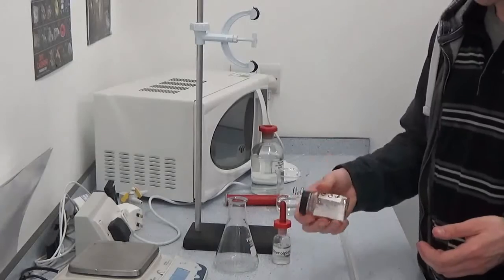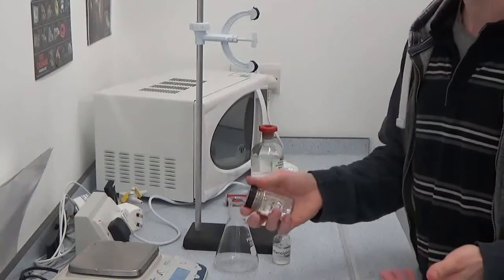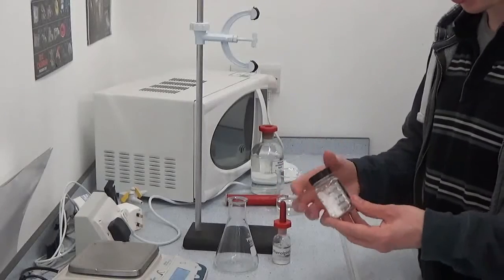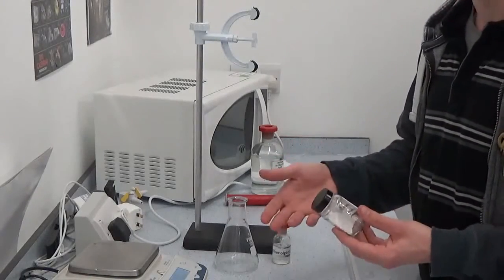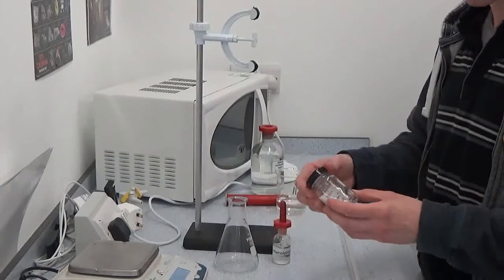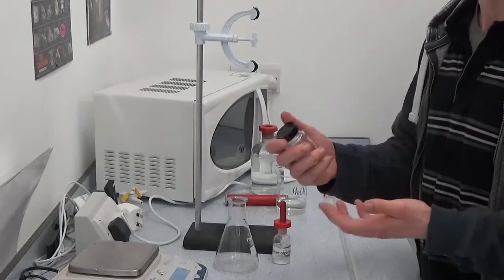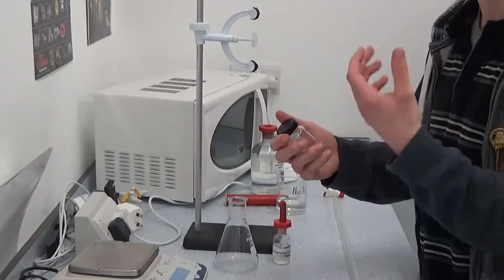I've got a substance here — it's a mixture of calcium carbonate and calcium chloride. What I'm going to do is react the calcium carbonate with an acid — hydrochloric acid. The hydrochloric acid will not react with the calcium chloride. I want to work out the ratio between the calcium carbonate and the calcium chloride.